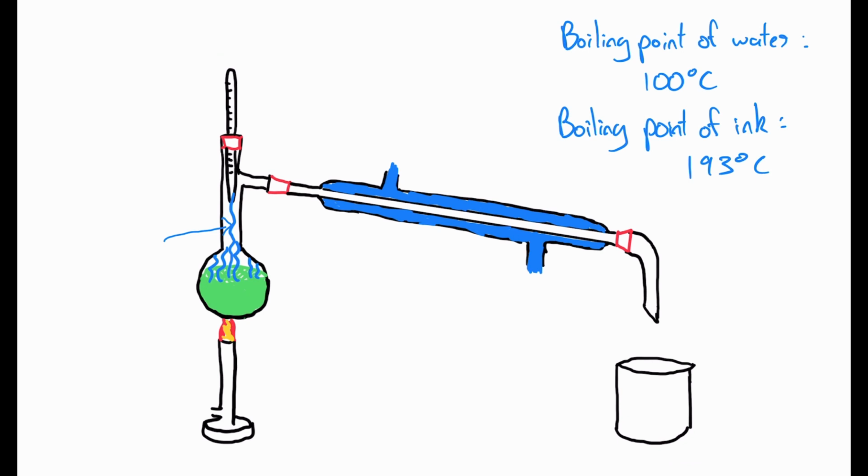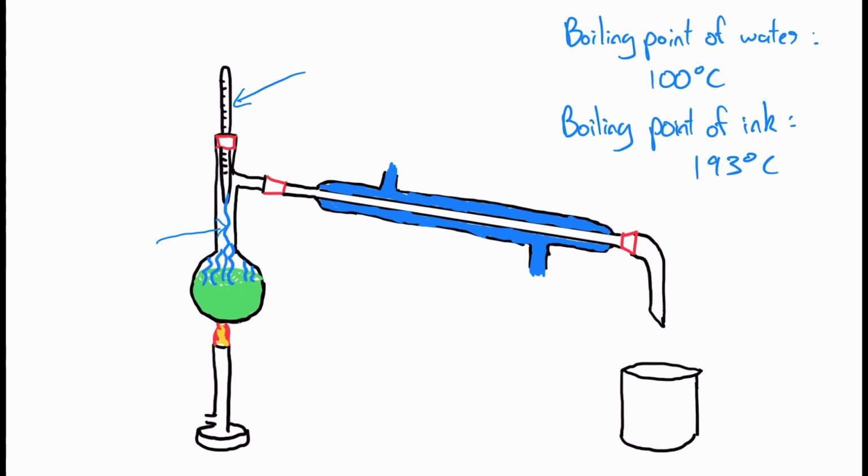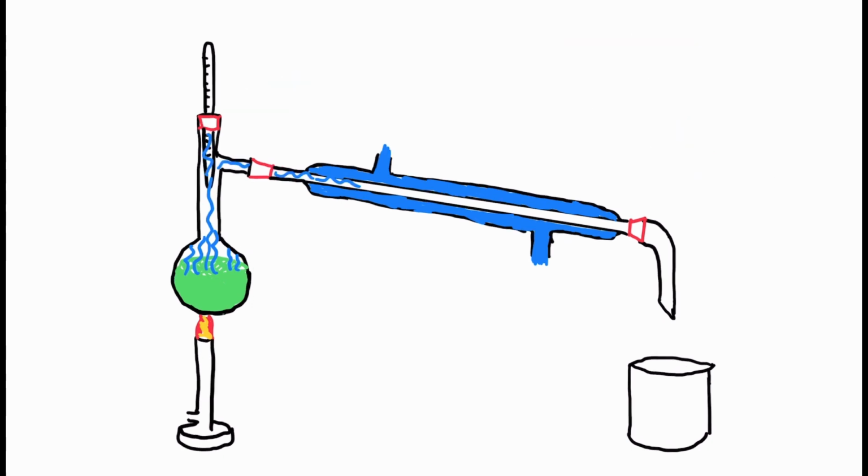So we would need to carefully monitor the temperature on the thermometer here so that it doesn't reach or exceed 193 degrees Celsius, because that would mean that we have ink vapor going into the Liebig condenser. The water evaporates first, turning into a gas because it has a lower boiling point. So now the water vapor has started to enter the Liebig condenser.